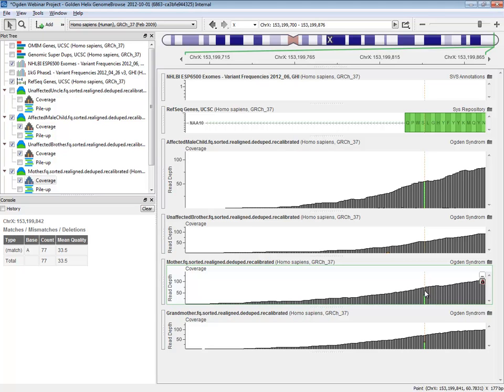That heterogeneity of the cell assay means that a valid cancer somatic variant might occur at 5% of the total read depth. All of that is very important and requires a different approach in SVS and Genome Browse, and I'll be talking about that in further webcasts.